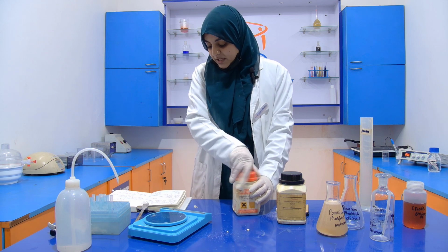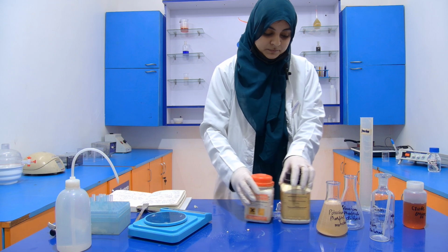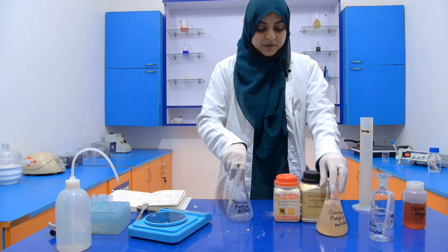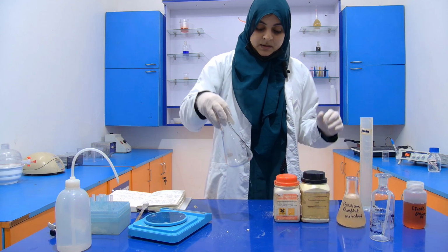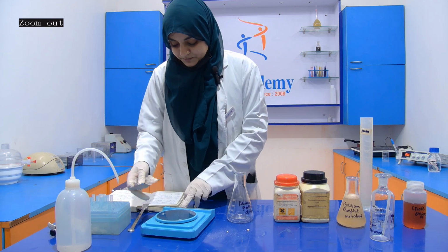So for dibasic, we require 43.54 gram and it will be dissolved into 250 ml of distilled water.